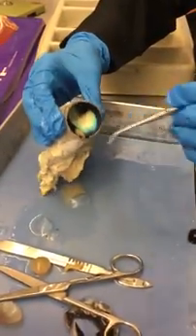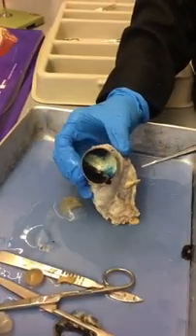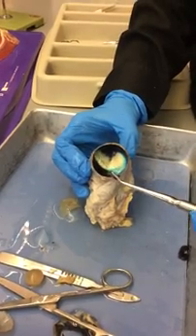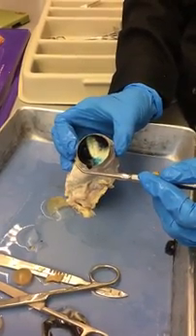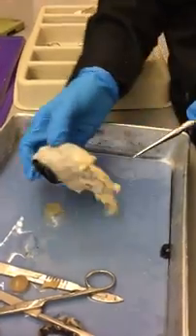And when I pull the retina off, you'll see the pigmented choroid. Look at that. Remember, this is a very vascular layer of the eye, so it provides blood supply to the eye, but it's pigmented, so it also prevents light from scattering in the eye. Okay, that's it. Wow.